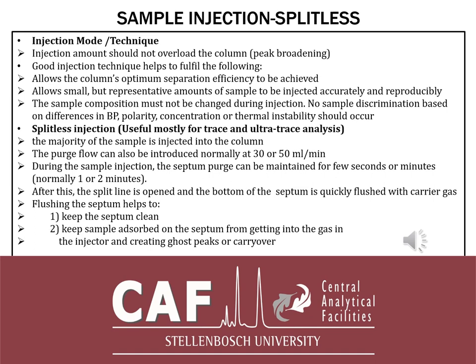And the other thing with splitless, as I said, if you're working in PPTs and lower PPBs, splitless injection will work much better. Some people ask, how do I differentiate between a split and a splitless? It is simple. If your peaks are very, very minute, very, very small, and you're doing split, and you start doing splitless, you can enhance that peak.